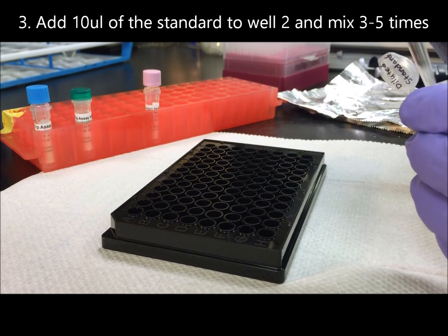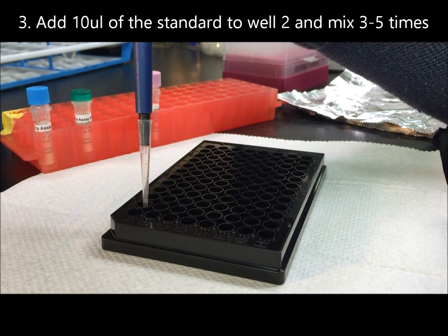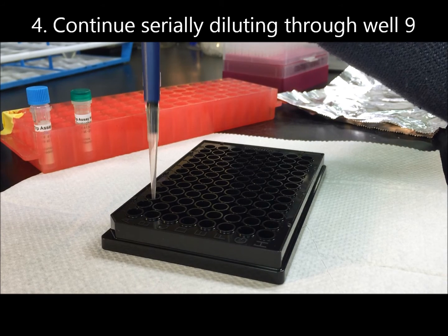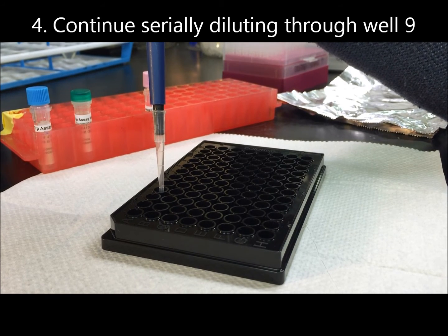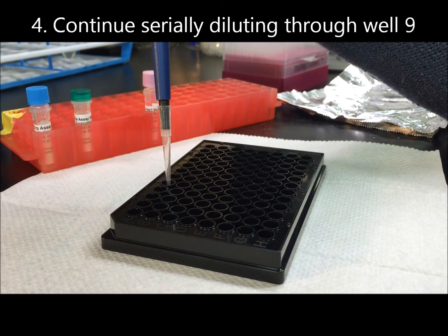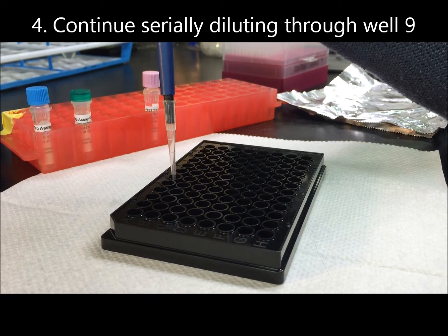Then add 10 microliters of the standard to well 2 and mix well 3 to 5 times. Continue serially diluting through well 9. Pipette gently to avoid any bubbles.